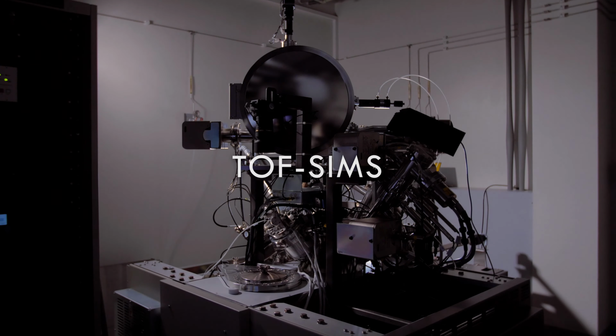The main fields of research where ToF-SIMS has proven useful are energy devices like fuel cells, batteries, supercapacitors, catalysts, geological samples, metals, glass, polymers, pharmaceuticals, and biomaterials. In our research in energy devices, we often need to answer questions as to why the performance degrades. ToF-SIMS has proven to be an irreplaceable tool determining what has gone wrong when a device has failed or is showing poor performance. Element mobility and segregation within cells has proven to be one of the major influences in performance degradation for solid oxide fuel cells.